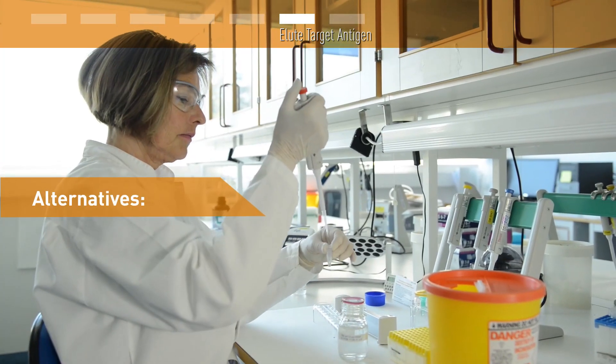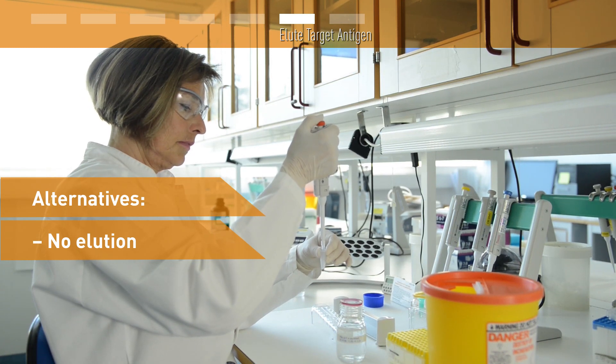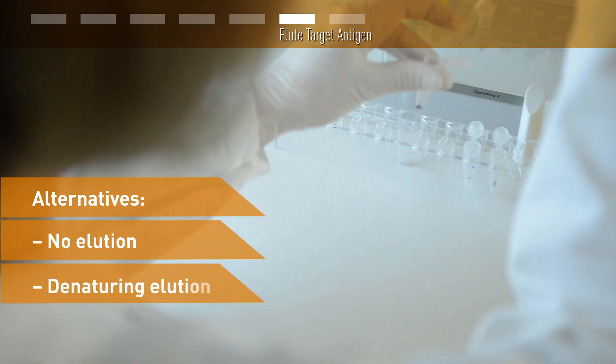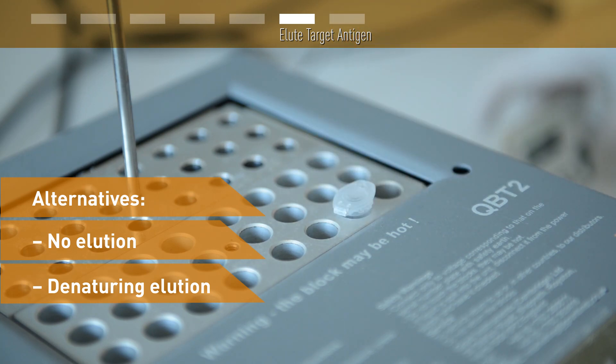You can either re-suspend your target protein while still attached to the solid phase and use this in your downstream experiments. You can elute the protein directly in your buffer for gel analysis or western blotting. When you elute in a small volume, you can keep your protein concentrated.